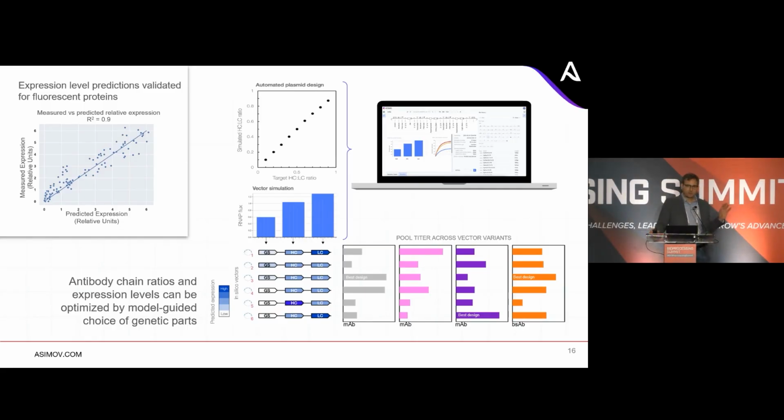But even before we've fully validated this quantitatively, our synthetic biologists have found this useful. And so we've deployed this internally in our kernel CAD software for our synthetic biologists to use. So a typical use case might be motivated by this observation that certain mAbs, right, are best expressed by certain combinations or certain ratios of heavy chain and light chain expression. And a different mAb will have a different preferred heavy chain, light chain ratio of expression.